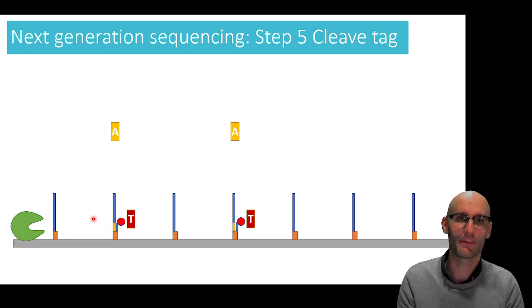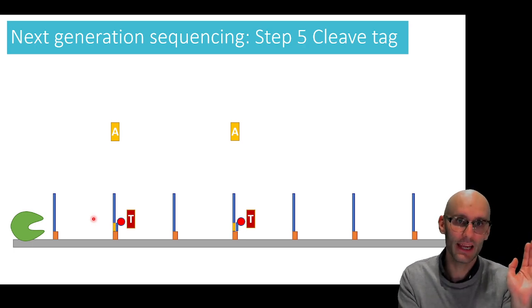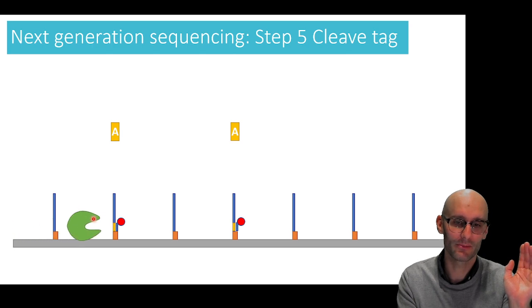And now what we do is something very clever. We run an enzyme through that trims off the fluorescent tag here. So this enzyme should come through and trim off the fluorescent tag there, which is nice.